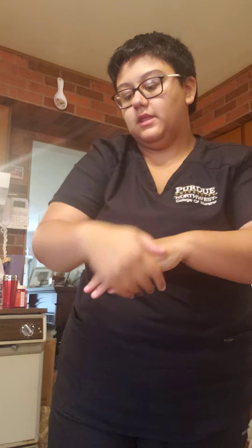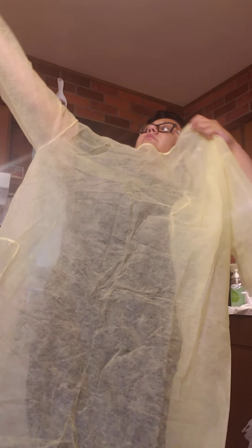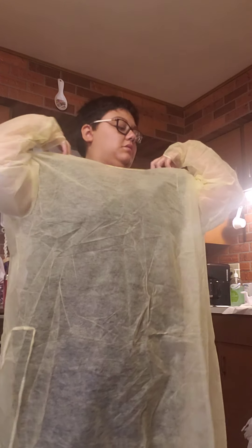Next I'm going to sanitize my hands. And then I'm going to put on my clean gown. I'm going to tie it in the front.